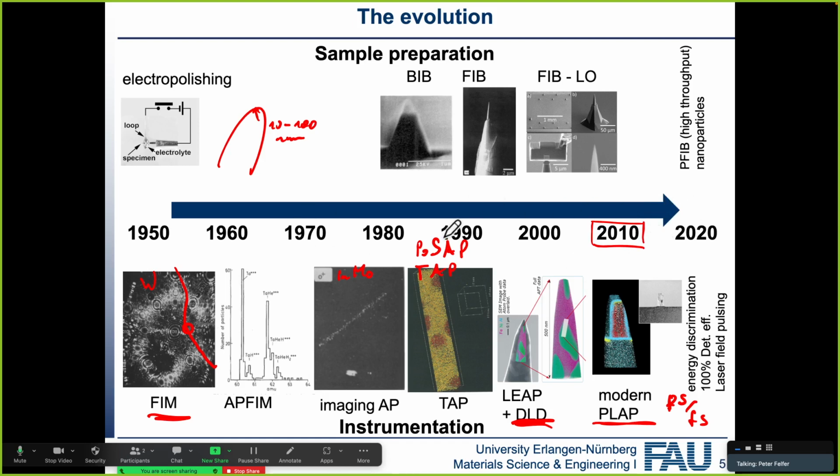All of that you can apply even on the most basic specimen you could have made in 1930 already. But what interests us these days, because we can work with non-conductive specimens, is, of course, that a lot of those specimens you cannot electropolish. Electropolishing only works for metallic specimens where the feature that you want to look at is going to be in your specimen anyway. Precipitation is a very good example, because precipitation is more or less the same everywhere.